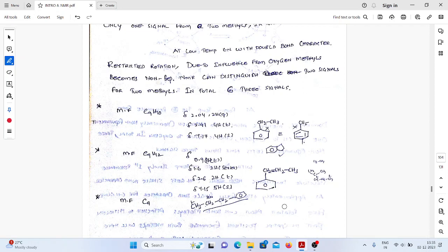At the last part of the proton NMR spectroscopy and C13 NMR spectroscopy, we will have some discussion on different kinds of structures: how you can determine the structure of a compound by using the spectral data. So this is about dynamic proton NMR.